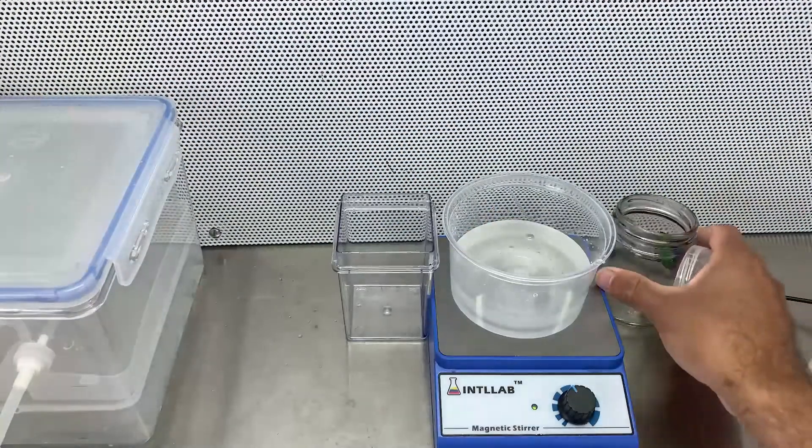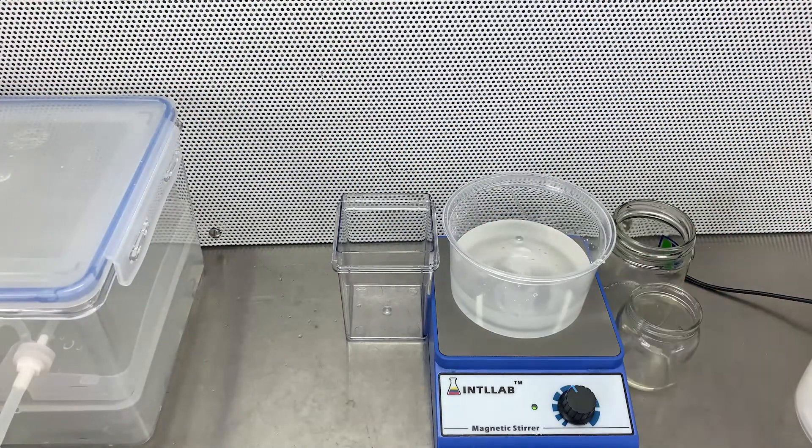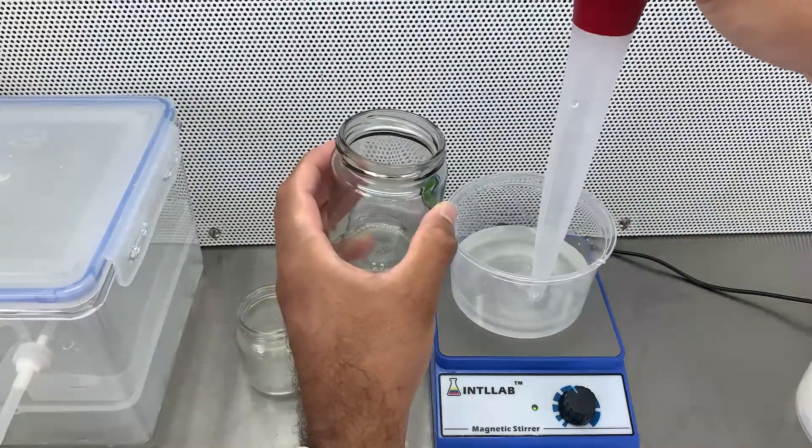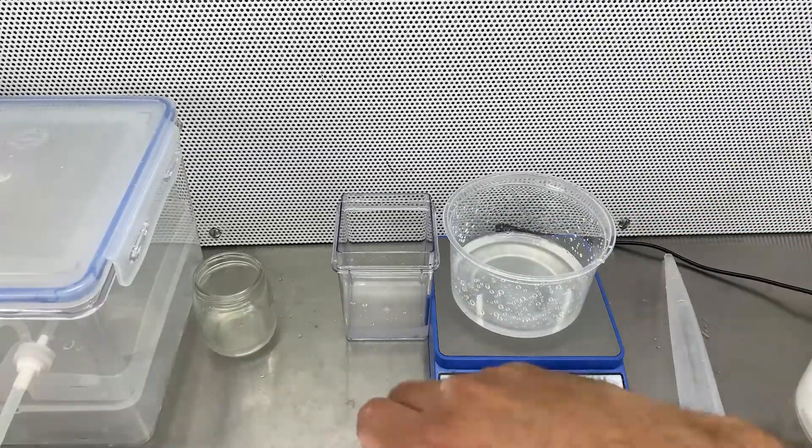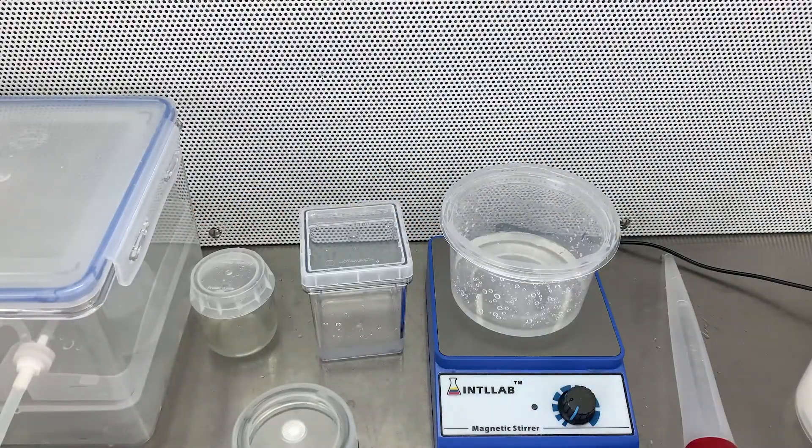The experiment is going to last 20 weeks, and at the end of the 20 weeks I'm going to deflask all the plants and compare and determine which was the best method to grow Heliamphora minor.